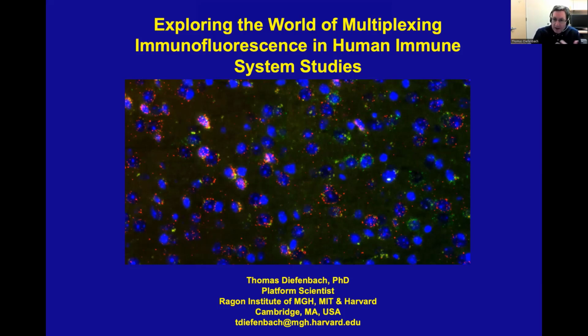And so a slide scanning system or format is quite amenable to that, because you can have higher throughput, you can look at many slides at a time, and you can look at many fields of view and stitch them together. As you'll see, I'll show many examples of this. Stitch them together so that you have sort of a Google Earth view of what's going on in the tissue, especially if you're looking for things like rare events among different cell phenotypes.